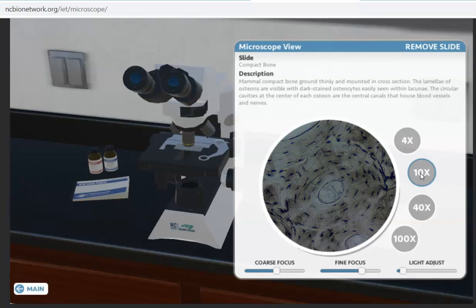So you would draw this particular osteon right here, and you don't have to draw all of them, just one of something will do the trick probably. So draw that one osteon there to the best of your artistic abilities. You will label the picture, and I'll give you guidelines for how to label your drawings, and then you'll just take a picture of those drawings and email it to me.